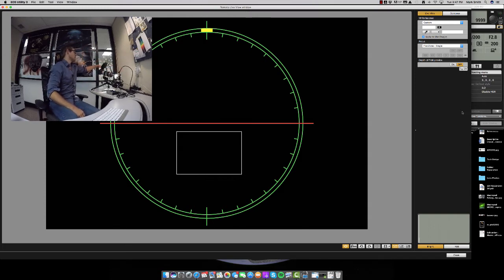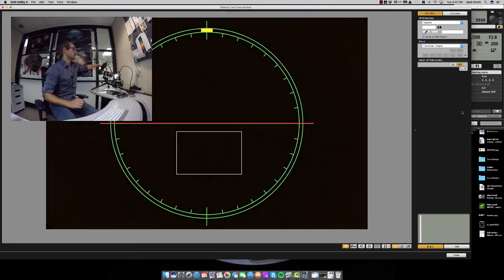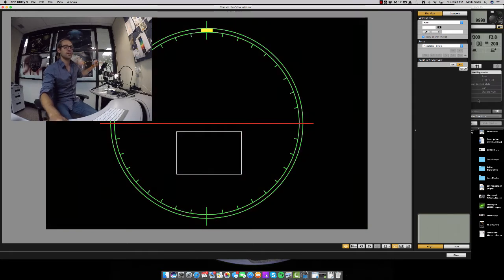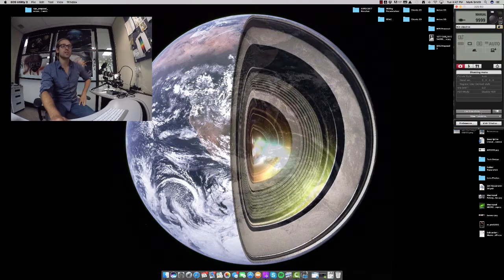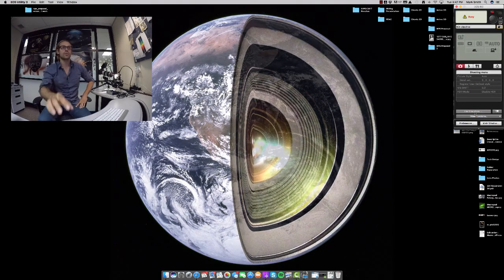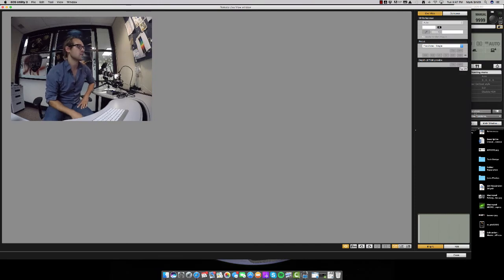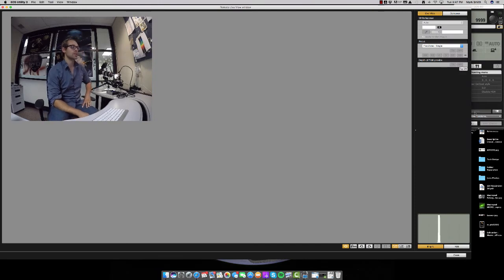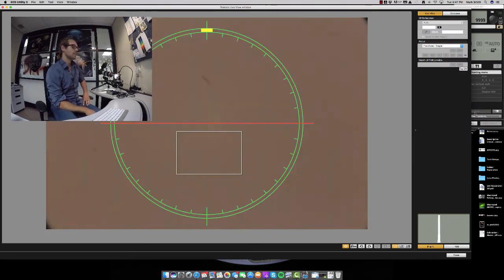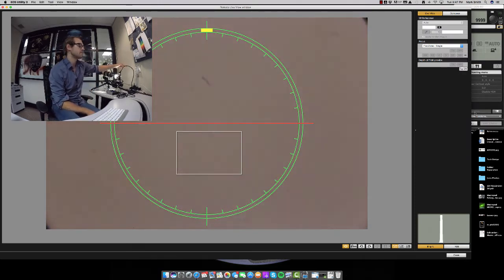Make sure your camera is in automatic. That way you can see what it is you're doing, you can see the sample moving around. I'm going to touch on some things we touched on earlier, but at least demonstrate it with the 50x objective.